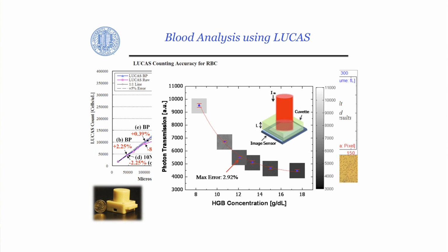I'd like to highlight one application of such lower resolution microscopes, in the sense that this microscope that I've shown here is equivalent to a 10x objective lens. I'll tell you tricks how we can make it equivalent to a 100x objective in the next few slides. But let's first start simple and seek solutions with this kind of a simple microscope, a resolution on the order of 1 to 2 micrometers, not submicron, but very large field of view, of course, extremely field portable, how this could even be useful without the submicron resolution.